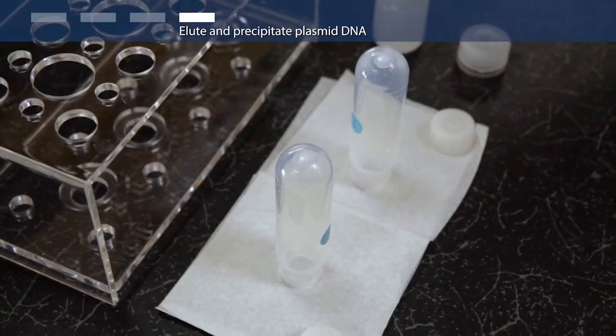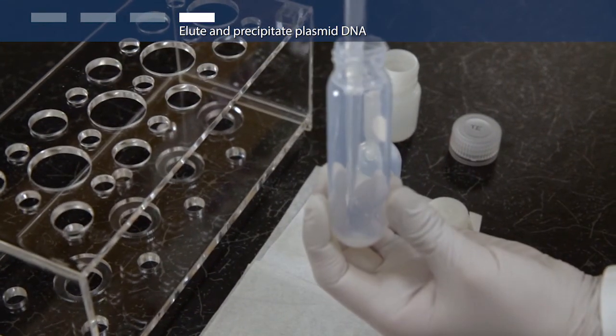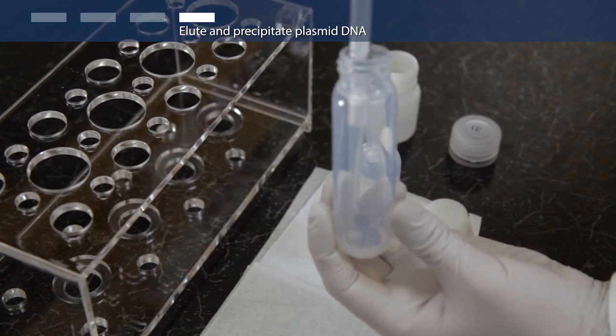Remove the supernatant. Air dry the pellet for 10 minutes by placing the tube upside down on a chem wipes tissue. Then re-suspend your purified plasmid DNA.